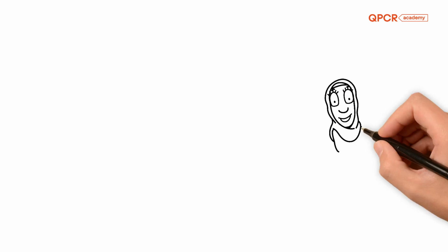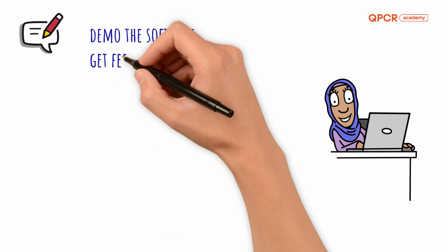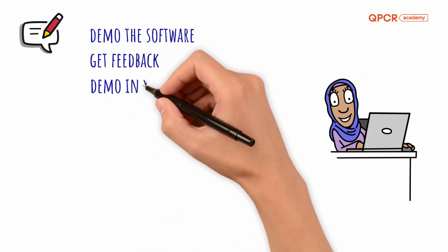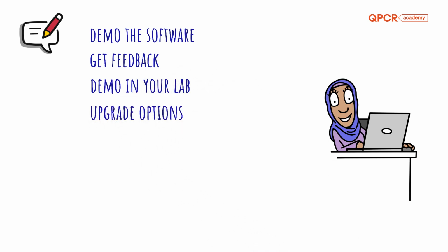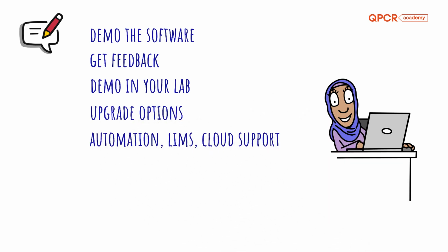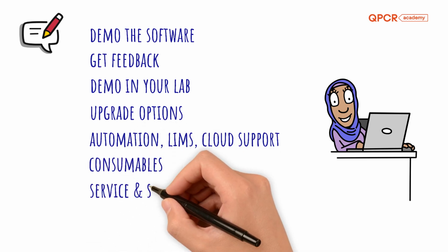Before we wrap up, here are 7 quick tips. Demo the software. Make sure it fits your workflow. Talk to other users. Real feedback is gold. Request an on-site demo. Test drive before you buy. Plan for growth. Can you upgrade the instrument down the line? Think beyond the box. Look for automation, LIMS, and cloud support. Check consumables. Are you tied to brand-specific plastics or free to choose?